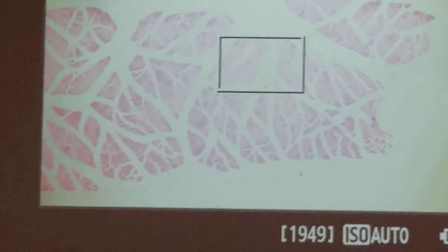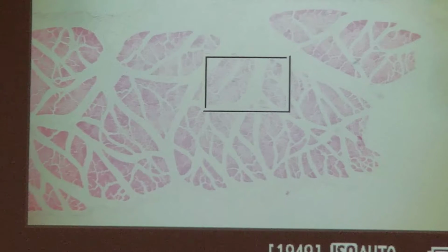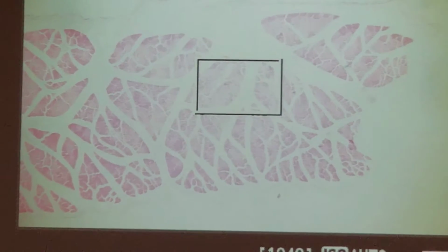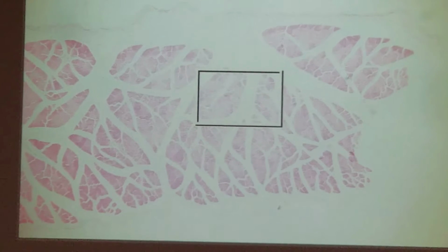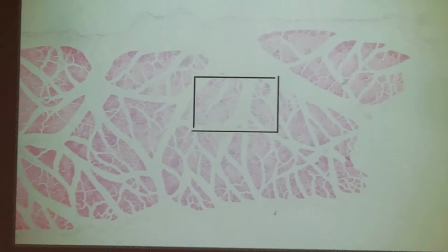And the last one, skeletal muscle tissue. This slide's a little bit different. We'll look at this slide again down the road when we do muscle tissue. Now, this slide's really two slides in one, so pay close attention to what I'm going to tell you. Down here at the bottom, that's a cross section of muscle tissue. So if this is a sample of muscle tissue here, we want to see it where it's running this way, and you're looking out here at it running that way.